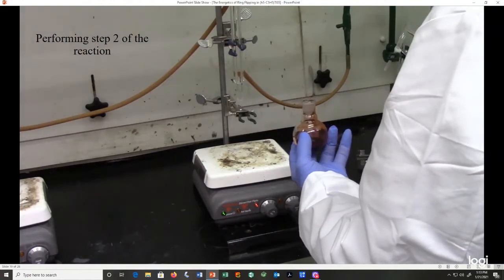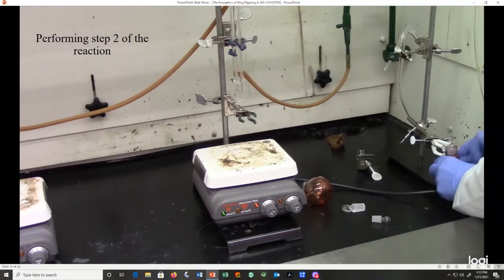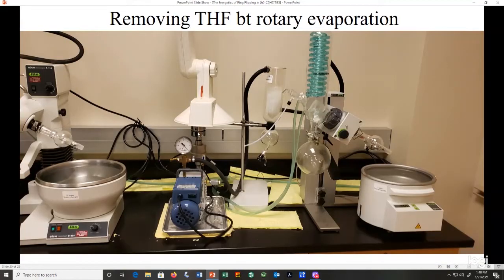So at this point, we are ready to go to the rotovap and distill off this THF solvent. Removing THF by rotary evaporation.